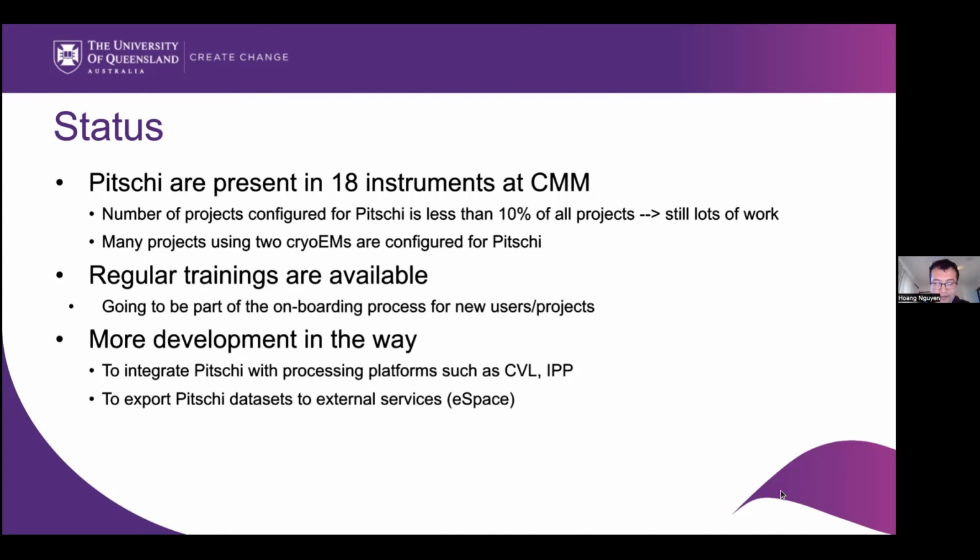So far we have Pitschi in the 18 instruments at CMM, and we've put 50 something, almost 60 projects into Pitschi. So that covers less than 10% of all the active projects. So there's still quite a lot of work for us.